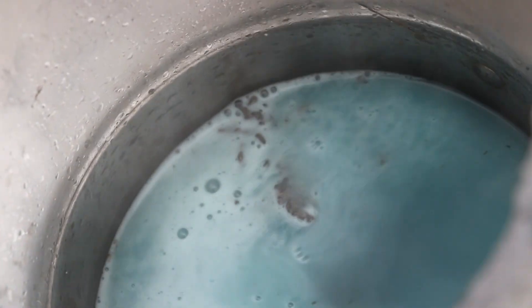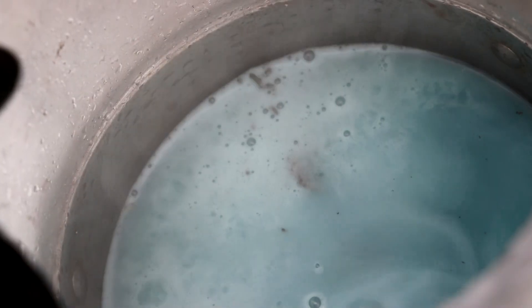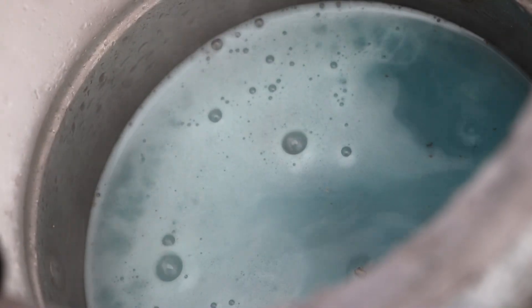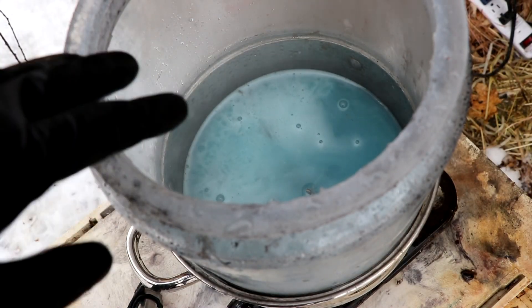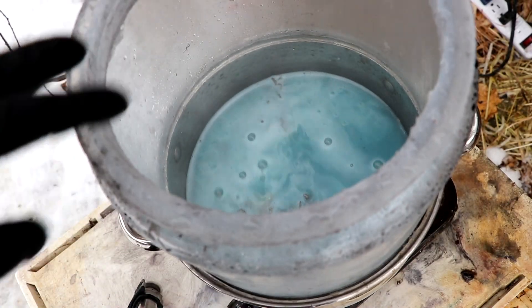Now we've got a reaction going. If I tip this over a little bit you can see the metal has turned a brownish color as the gold particles are forming on the surface — those are insoluble. The gas coming off this should be nitrogen dioxide, otherwise known as red death, hence why I'm doing this outside. A little bit is okay, but a lot can kill you because it forms nitric acid when it reacts with water, which is why you want lots of good ventilation when working with this.